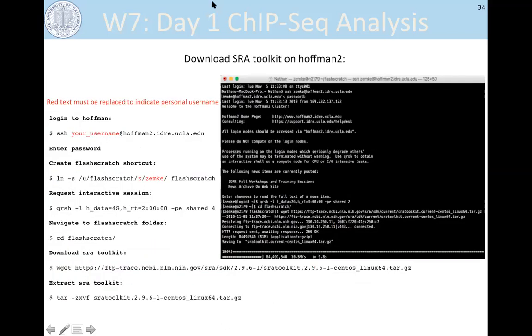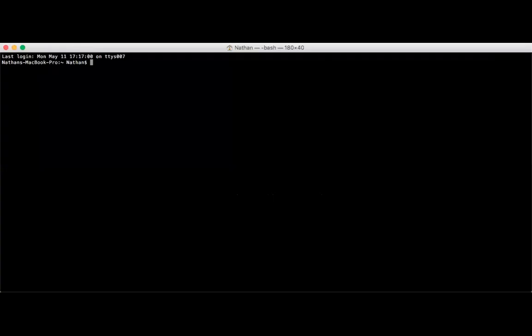I'm gonna open and share terminal so I can type along with you.